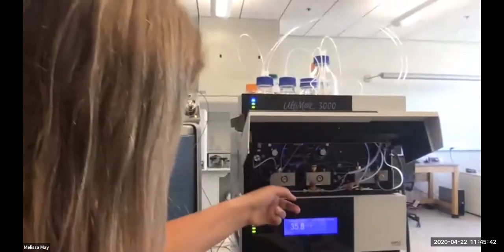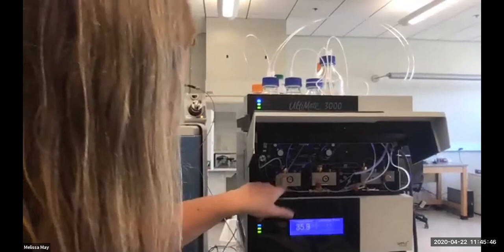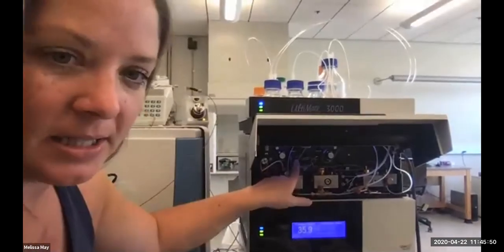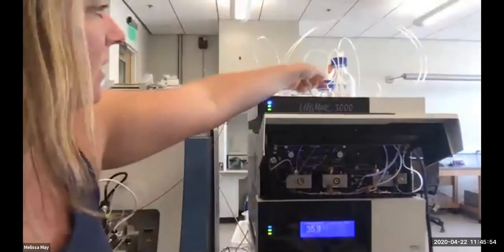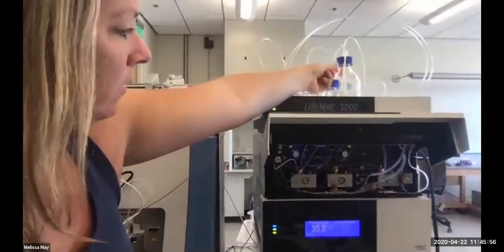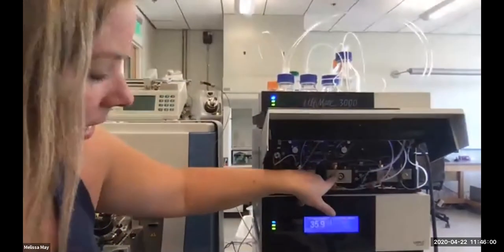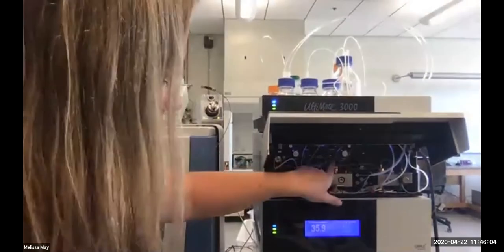And then it's going to go in down here into our left block. There are tiny little Viper connectors that put it up into here. And then over here, we also have our purge valves. Same thing with solvent B. Where did solvent B go? This one. So it's connected here. This goes into the right pump block. We have our purge valve and your inlet.